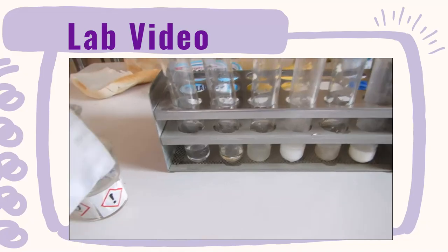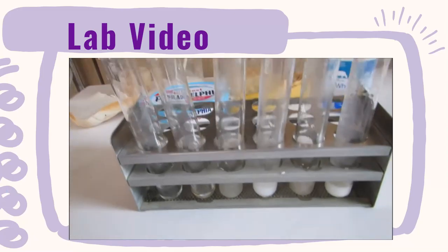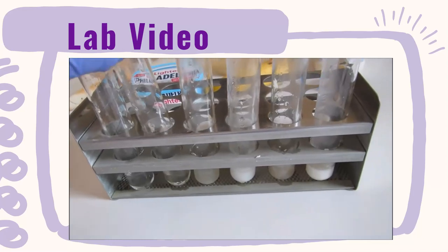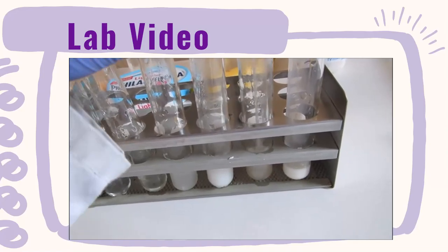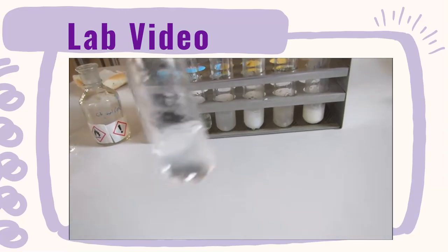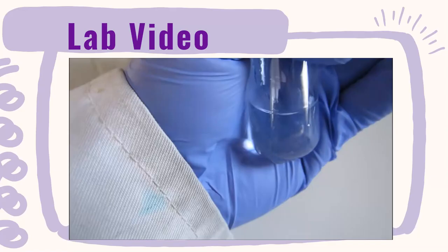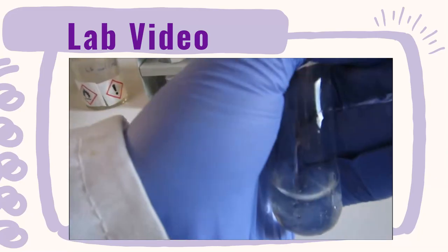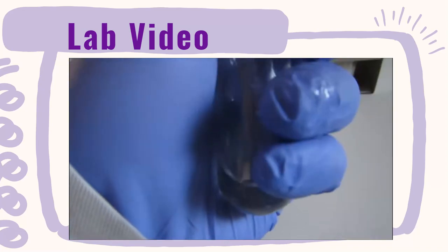So to test for fats, there's two different ways of doing this. One, you can put some of the solution onto a bit of brown paper and see if it leaves grease. Another is to add some ethanol to the solution. So I'm going to add some ethanol to each of them. I'll just quickly add to the whole lot and then talk through the reaction. Hopefully that's enough. So to our first one, if I give it a shake, you can see it's kind of one layer. It looks much the same as water. So there's been no reaction.